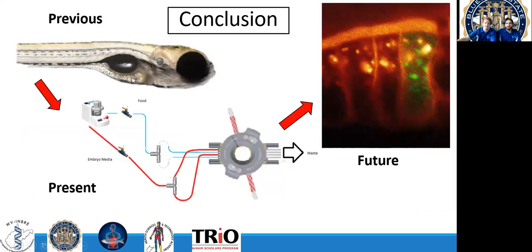In conclusion, our project started with imaging and measuring 7 DPF larvae to determine a correct chamber size. After the chip was printed, we mounted larvae into the slide to pump fluids through the larval chamber to the larvae. Our next step is to feed high-fat diets to the larvae that are mounted into the chip and image single-cell processes. We can fluorescently label lipids to track or monitor the unicellular processes shown in the enterocyte here.